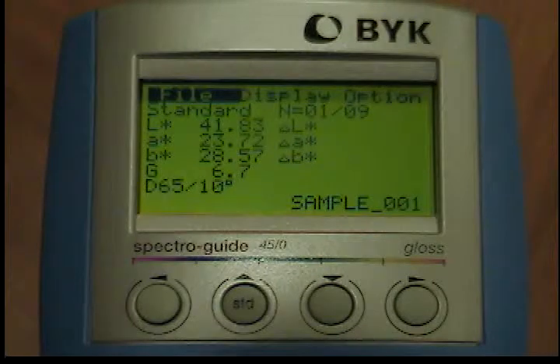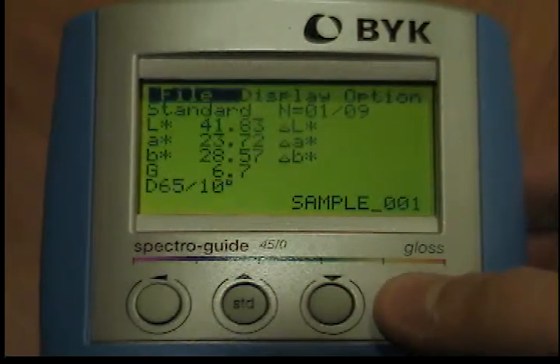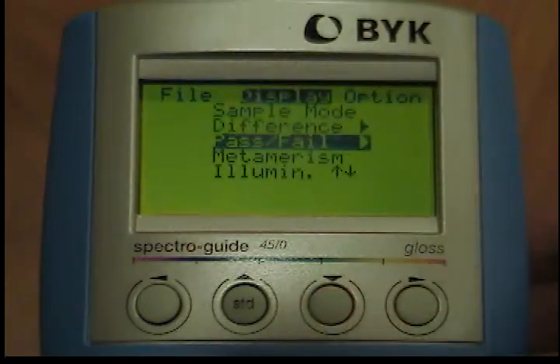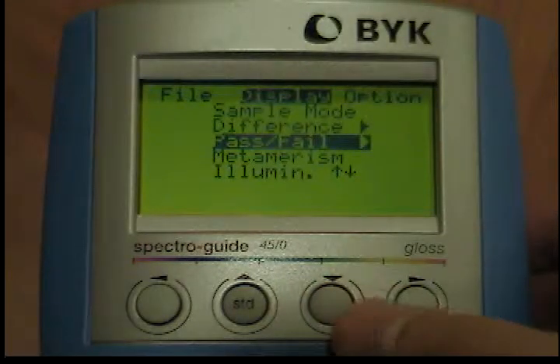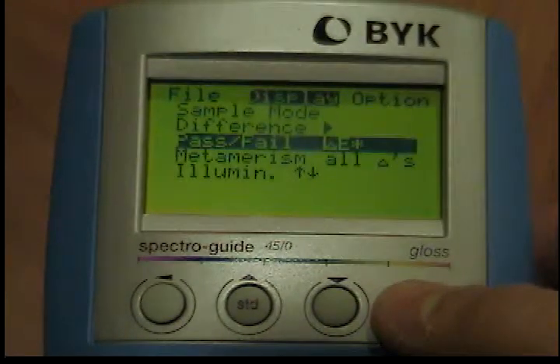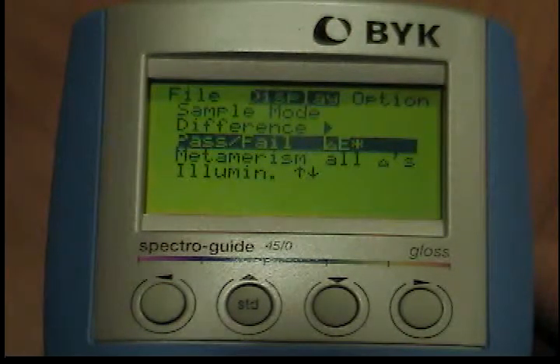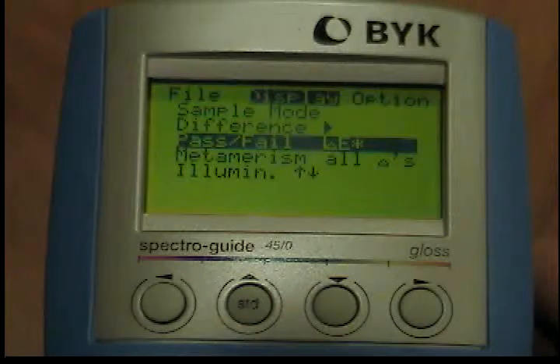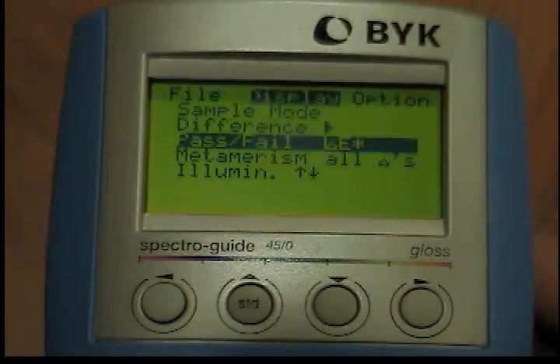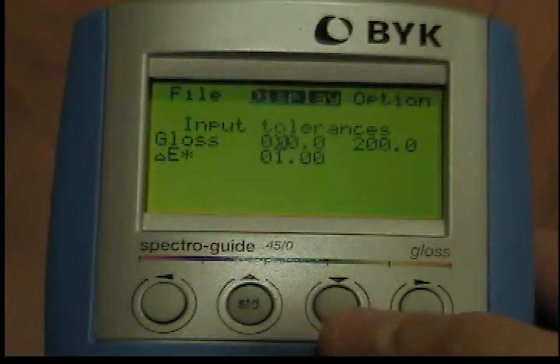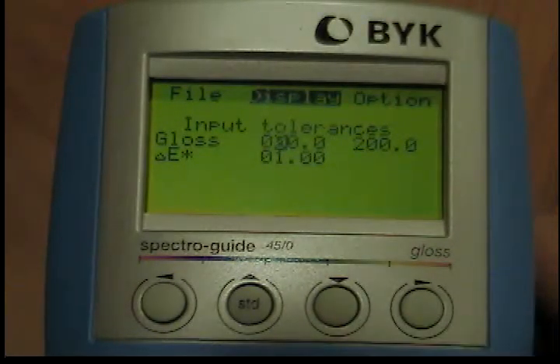To get to pass/fail mode from the display menu, use the down button to move the cursor to the pass/fail option. You can either insert only delta E values or individual components as well. To make this selection, use the right button to delta E or all deltas. If you perform a measurement in this mode, you will receive a message indicating whether it lies within pass or outside fail the tolerance. A beep also sounds when the result is fail.